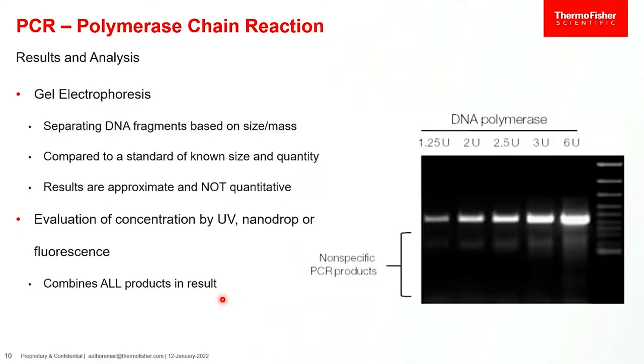There are some regions that are easy to design in, and there are some regions that are terrible to design in. But if you don't look for it, you're never going to know. And this is the cautionary tale of that. Just because you make something and it looks great on a gel, that's not necessarily the end of your investigation.